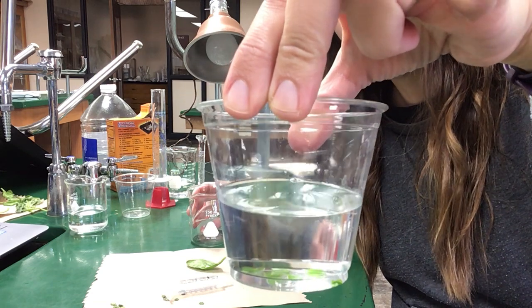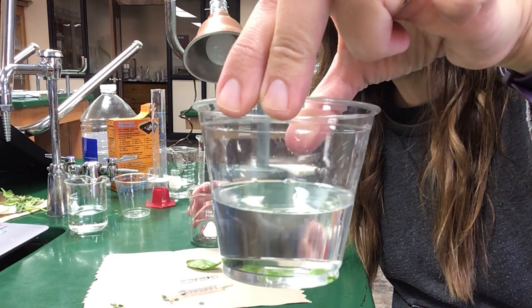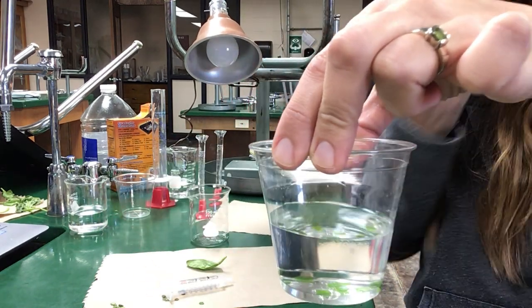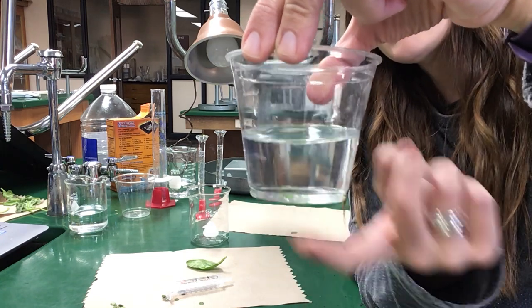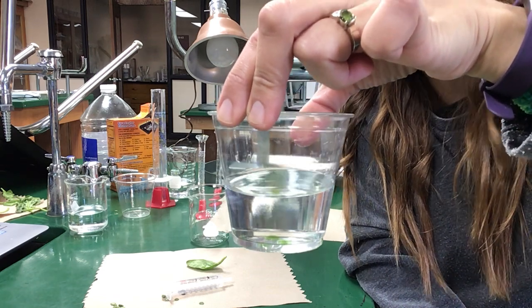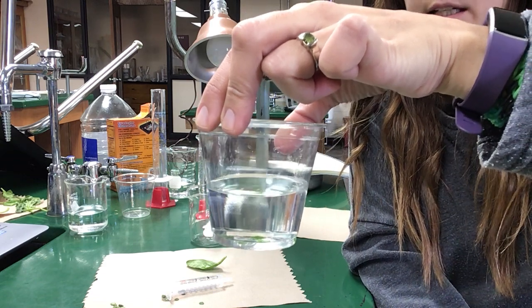What I'm gonna do is put one in light and one in dark, and I'm gonna time it, and every minute I'm gonna count how many leaf discs float or start floating to the top. You can see here I have my light source that I'm gonna put one in, and then I'm gonna do the exact same thing with these leaf discs and put those into a cabinet in the dark. I'm not gonna make you watch these leaf discs float, but I am gonna get you the data.